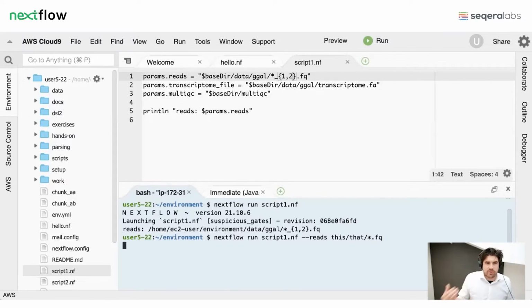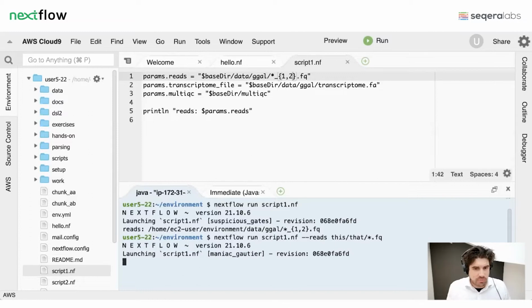And then that's just going to print it to the screen in this case. Now, the script is not doing anything yet. This is just showing you how you can modify it. So what I want you to do now is take this script section 1. I want you to confirm that you can run that.